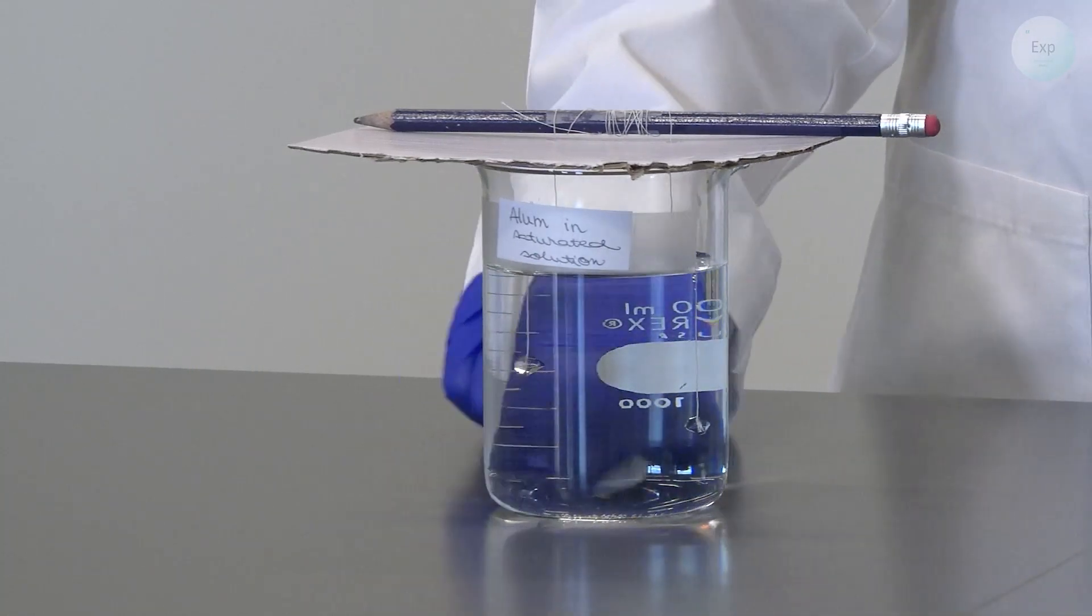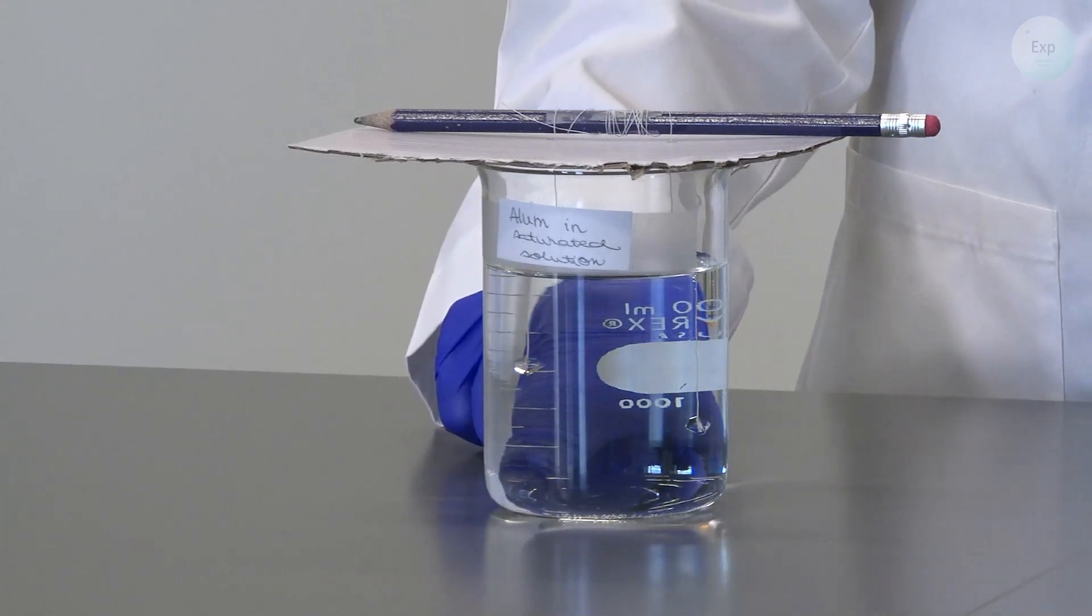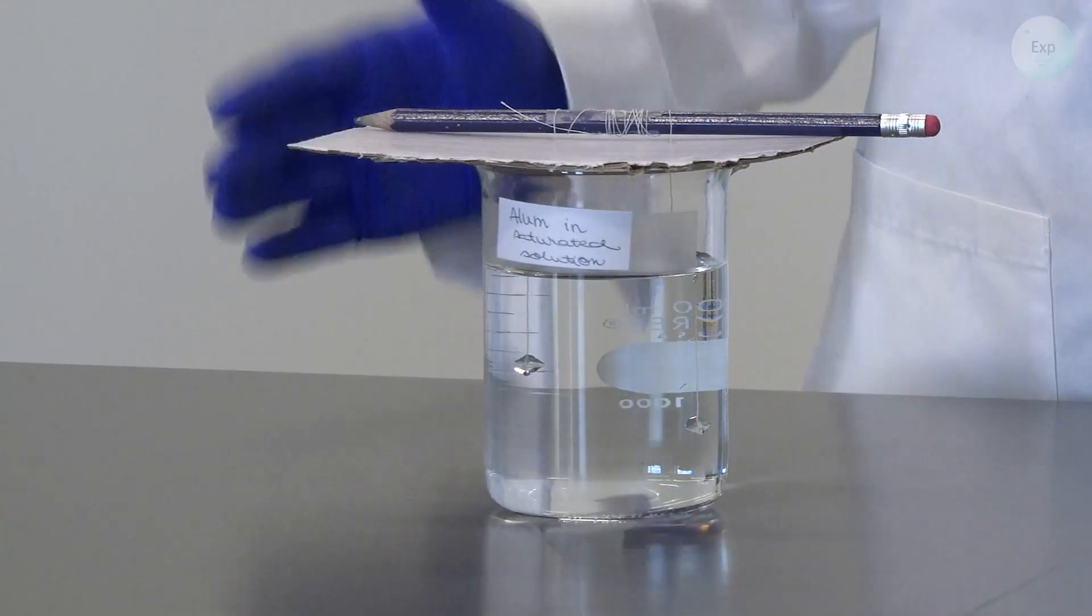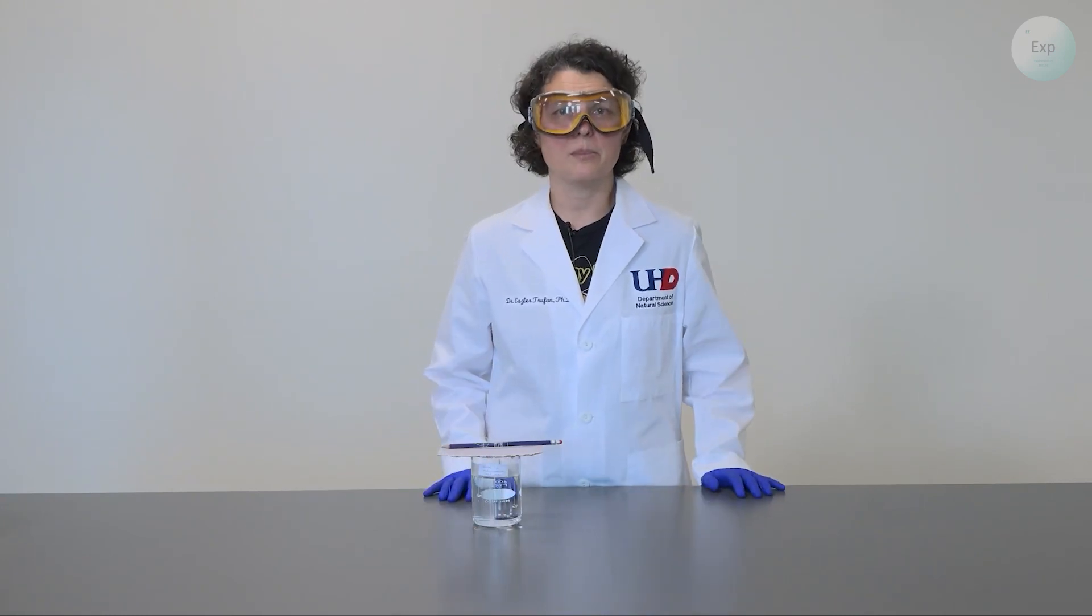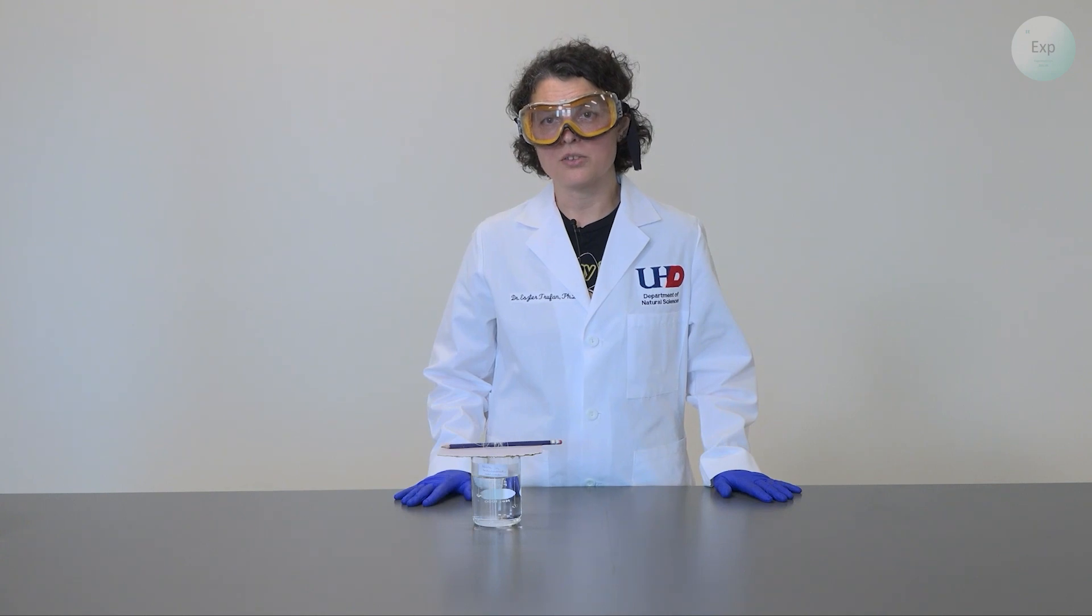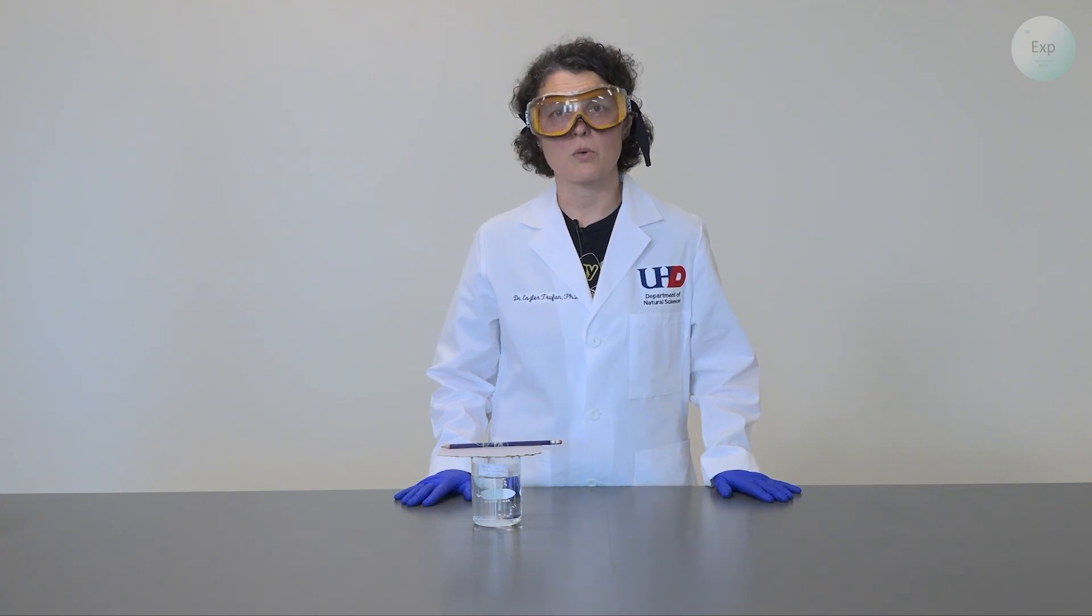You'll also notice that there may be some small crystals growing on the bottom, and there may be some small crystals growing on your thread. Now, all of those crystals that are in your solution are competing for growth. The more you have in there, the more difficult it will be for your large crystals to grow even bigger.